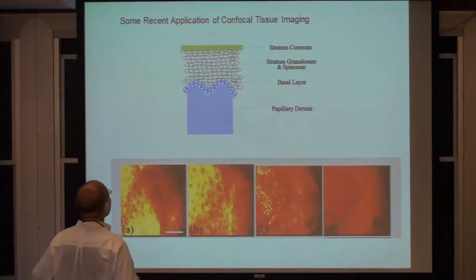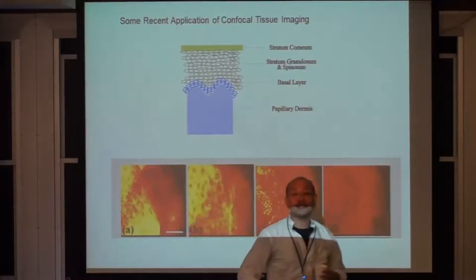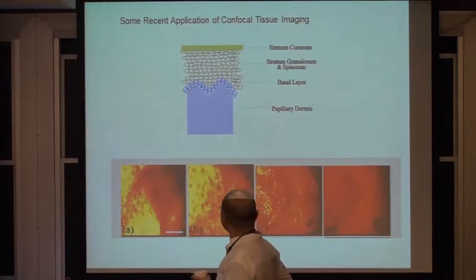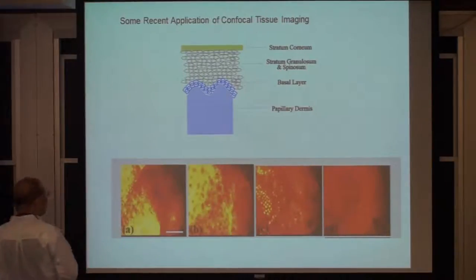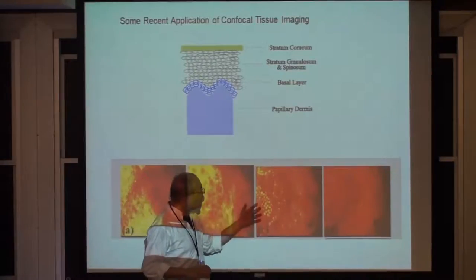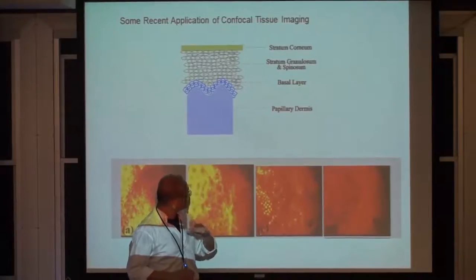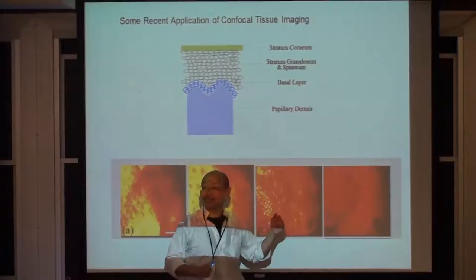In the dermis, most of it is a matrix material, consisting of collagen and elastin fiber with a sparse distribution of fibroblasts. So if you use a confocal microscope and image through it, for example, when you get to the dermal layer, you can actually see, this is actually mostly melanin cap sitting on top of the basal cells.